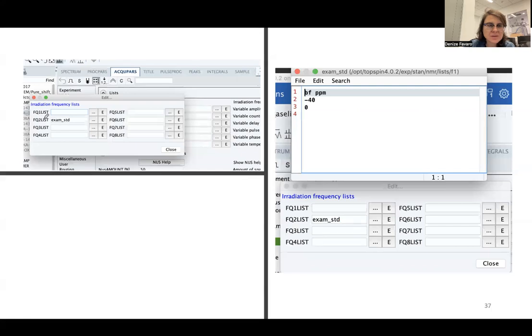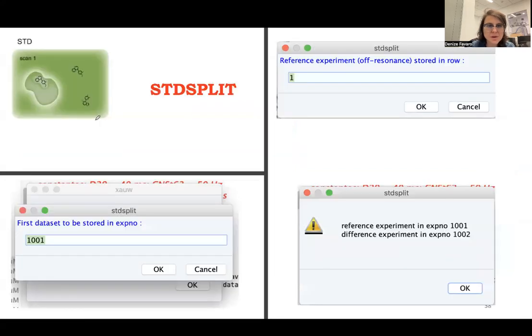The FQ2LIST I can click on list and go there and just set. I can click on edit if I want to edit this parameter. This, for example, is in ppm. So it's minus 40 ppm and zero ppm. I can also load if I have saved before, or if someone has some list saved, I can just click on the three dots and also load a previous list.